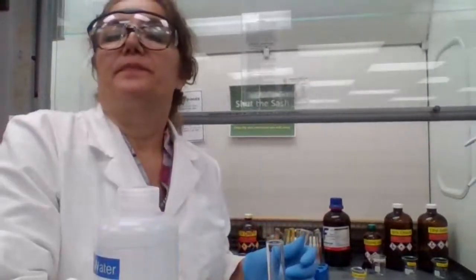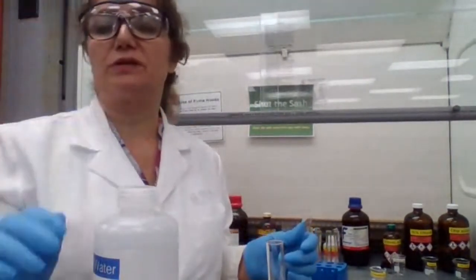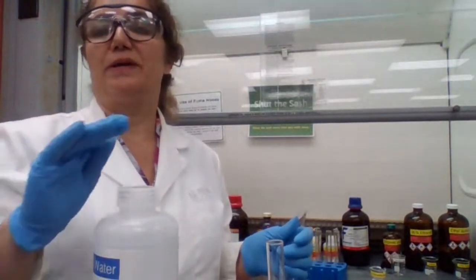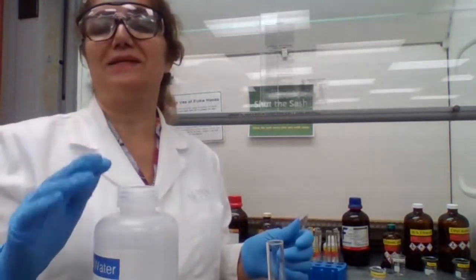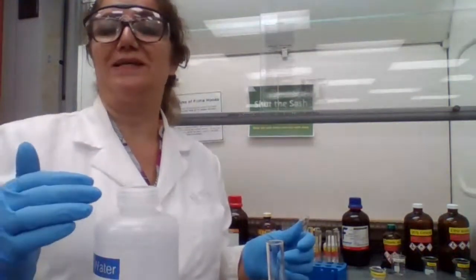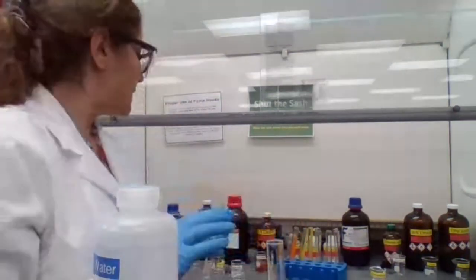Okay. You can check probably for the Tollens, you took the screenshot. Please use the screenshot for that because you could see the evidence, whether there is a precipitate or not. For Tollens reagent, the evidence is whether the silver mirror is going to form or not. Okay.